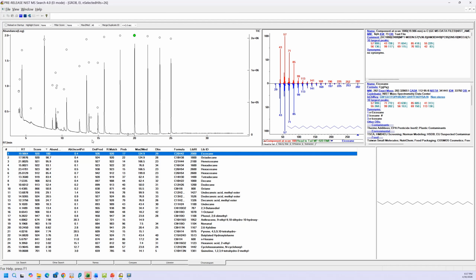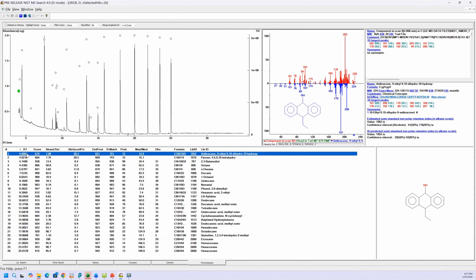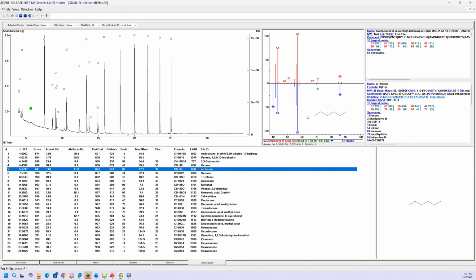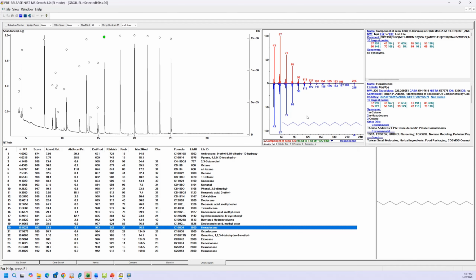Myself, I like to look at things from left to right, so you can notice the retention time is not in that order. So I'll click on retention time, brought the longest to the top. I'll click again, and now I have the smallest retention time at the top. And what I like to do now, if I'm just reviewing the data, I like to just step through it using the keyboard keys, the arrows. So I left click on the first one, and then I just do the arrow for the second, and you can see I can go up here and look at all the results up here and see the structure for everything. So you can quickly step through everything and see if that's what you would like. So I find it very easy to review things.